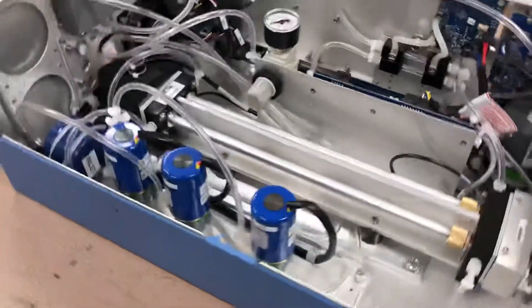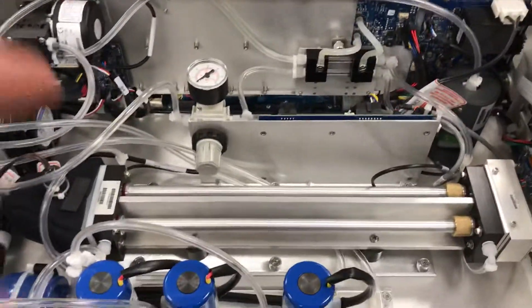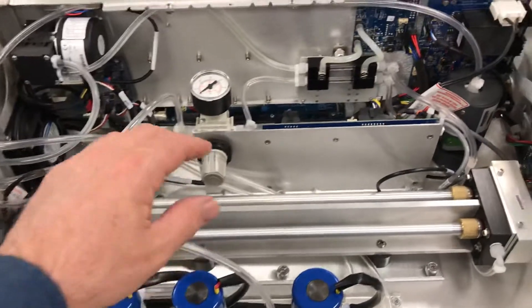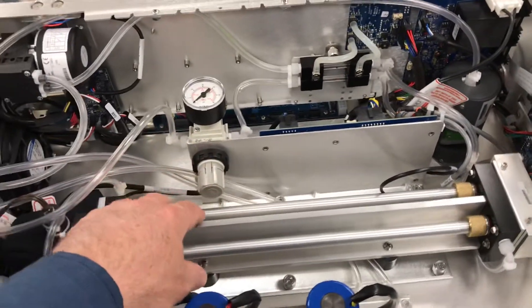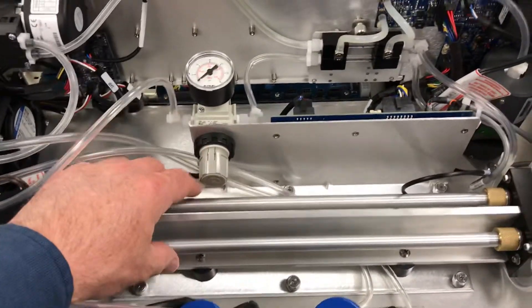Coming around the side, there are lots of changes on this instrument as on the previous ones I've been posting. They've done a great job at putting the reaction cells for these instruments — whether it's H2S, SO2, and now ozone.